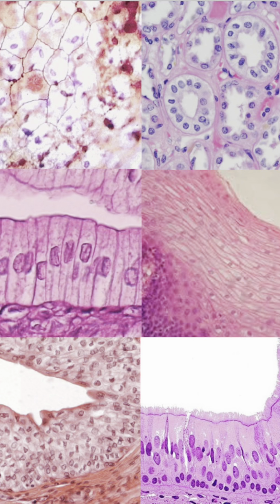This right here is epithelial tissue. This is a type of tissue that is very membranous, meaning there are different types of membranes involved that make it up. It's made up of cells that form different types of surfaces and linings throughout the body. It's commonly located on the surface of organs, such as the lungs and heart. It's located in blood vessels and glands.